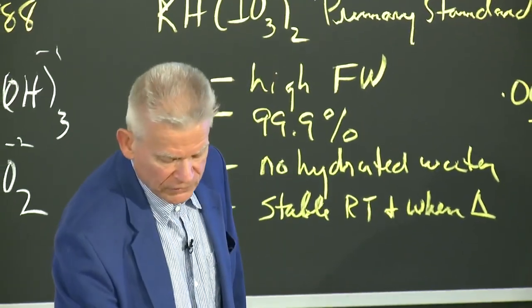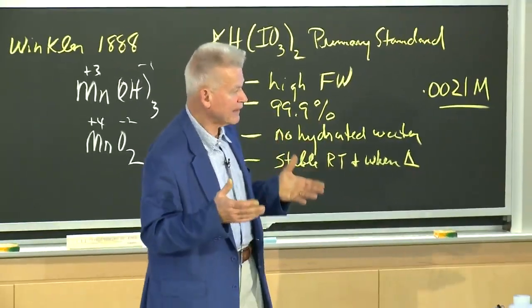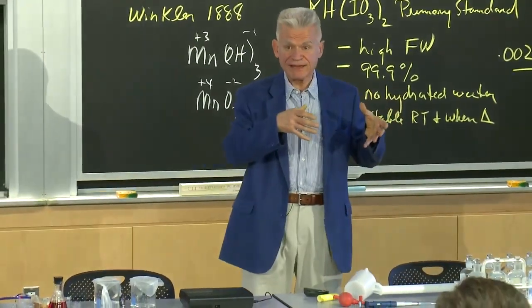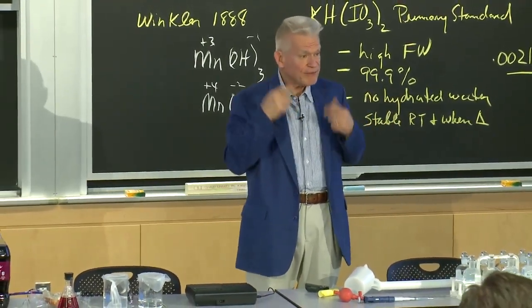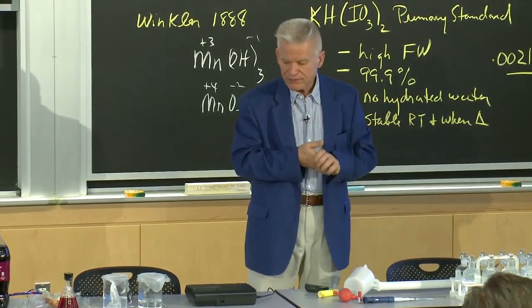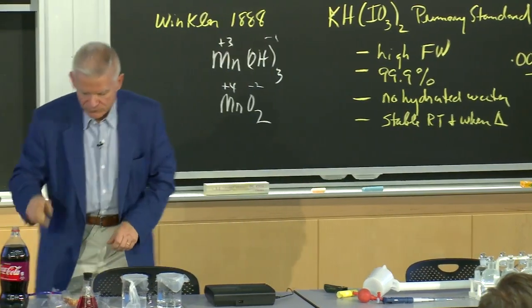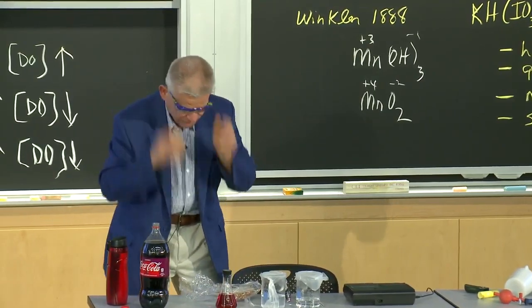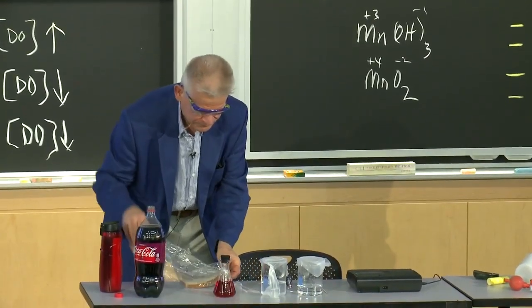So starch actually reacts with iodide and iodine, gives you that blue-black color. So if you're titrating something yellow to clear, sometimes it might be harder to see. Right? So what Alex said was your solution actually reacts with starch.